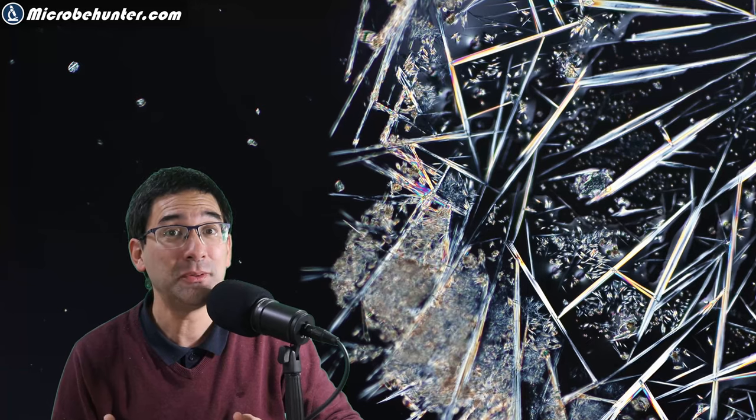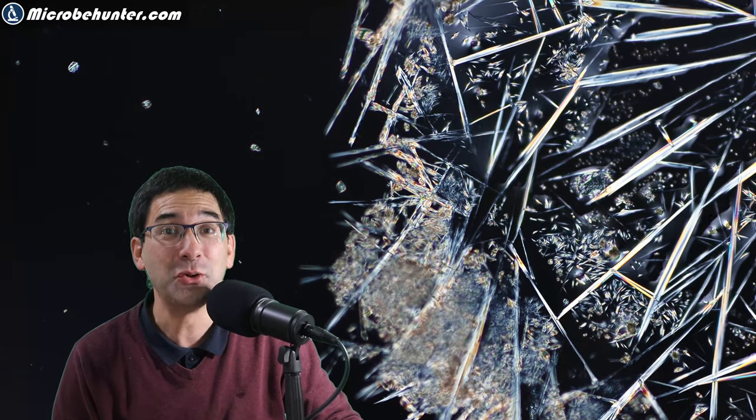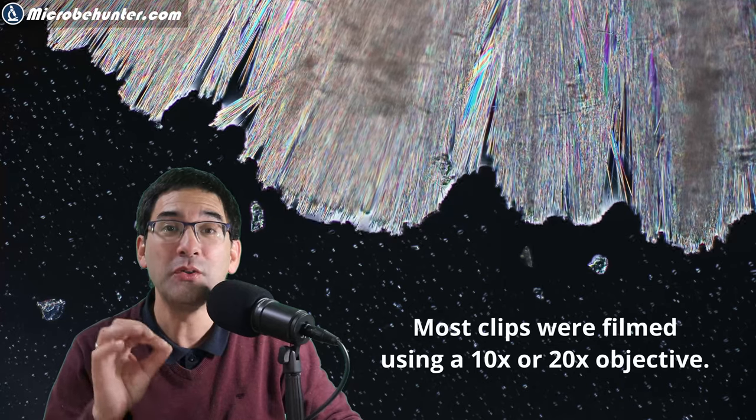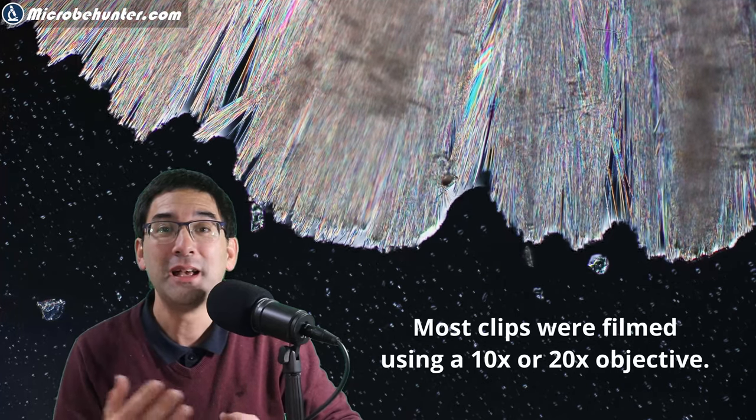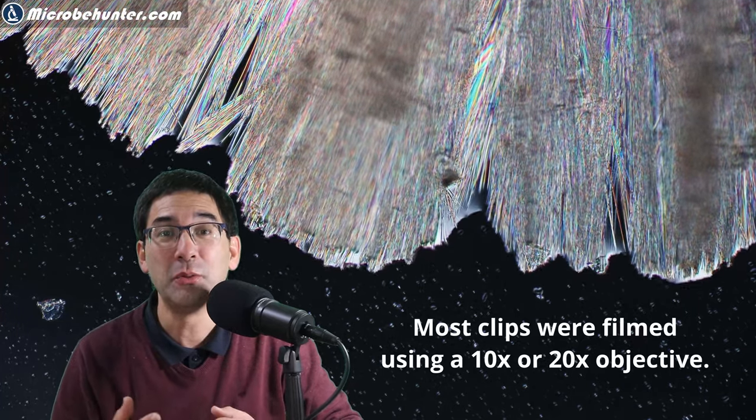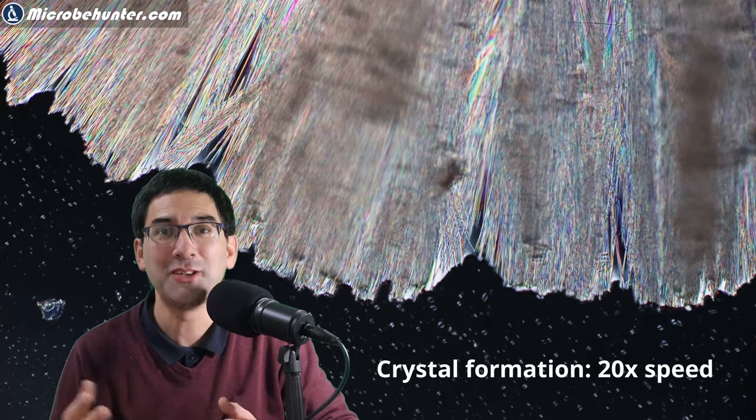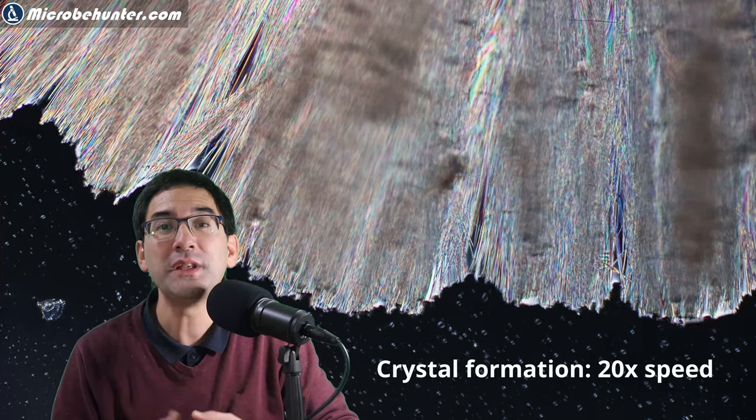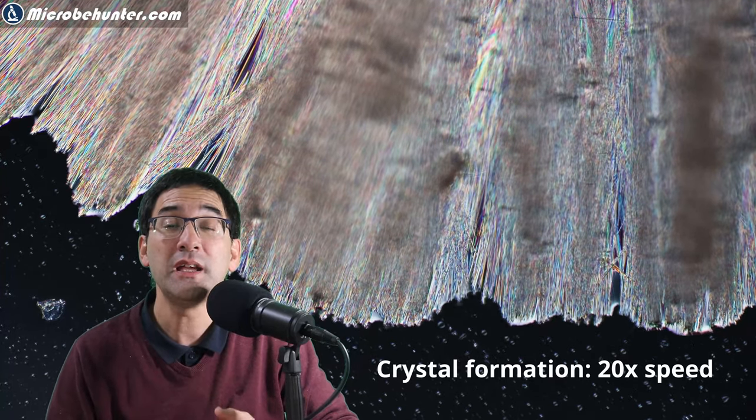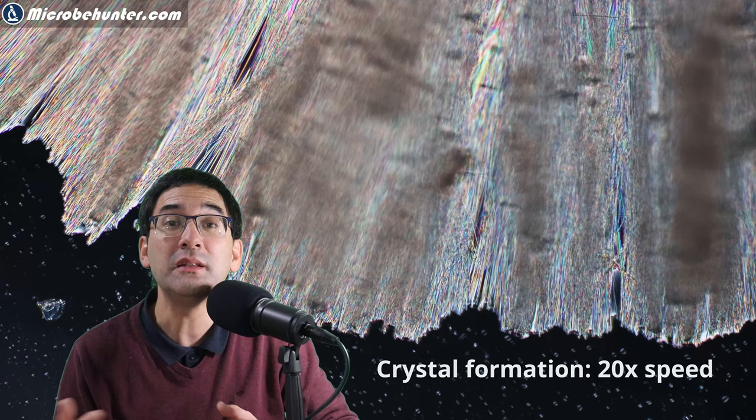One of the things that I like about caffeine under the microscope is that the crystals that form look quite different depending on the concentration of the caffeine and also where on the slide the crystals are forming. I also like to observe the growth of the crystals. In all cases, the crystal growth is shown in time lapse, usually around 20 times speed, so you're able to see how the crystals start to form.